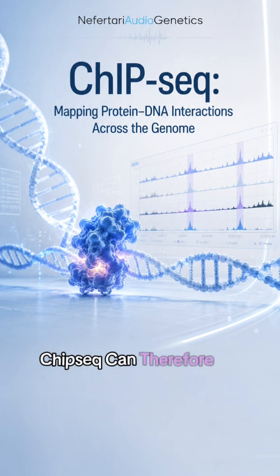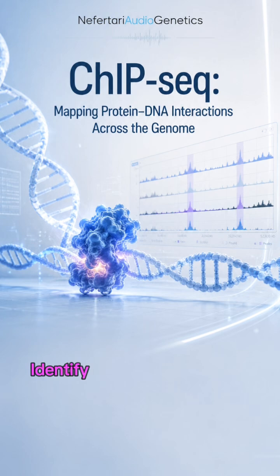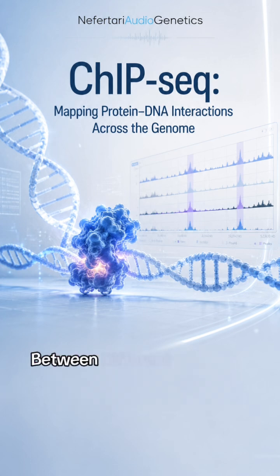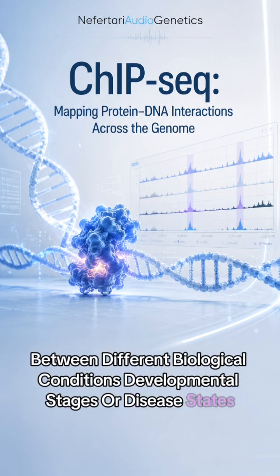ChIP-seq can therefore be used to investigate transcriptional regulation, identify potential regulatory elements, study gene regulatory networks, and compare regulatory landscapes between different biological conditions, developmental stages, or disease states.